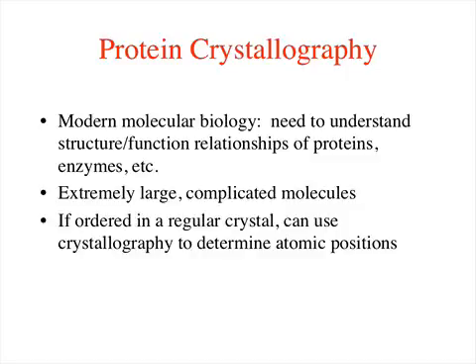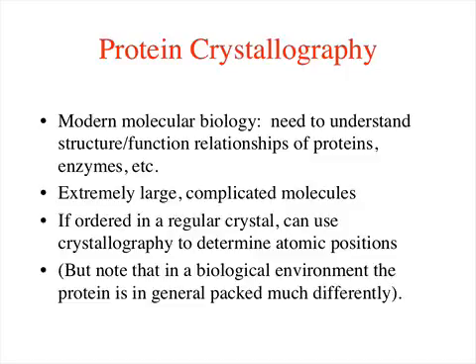It actually requires a substantial amount of computation, and modern protein crystallography didn't really develop until the advent of easily accessible large-scale computing. You should notice, however, that even if you have completely solved a protein in a crystal structure, in a biological environment it's probably swimming around in an aqueous solution or perhaps attached to a membrane or something, and it may actually be packed quite differently. Nevertheless, you can still use the results of crystallography to inform your ideas of what it might be doing in that more important environment.